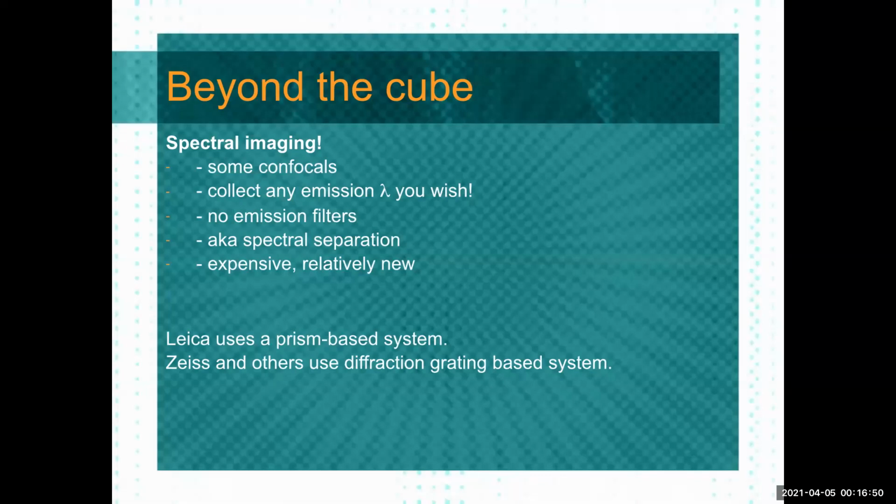Okay, give me 560 to 565. You get the idea. You start stepping it along, and you're basically going to recreate that spectra that was given to you for the fluorophore. Or if you're using a fluorophore where you don't know what the spectra is, you can actually use the confocal to capture and know the spectra of what you're looking at.